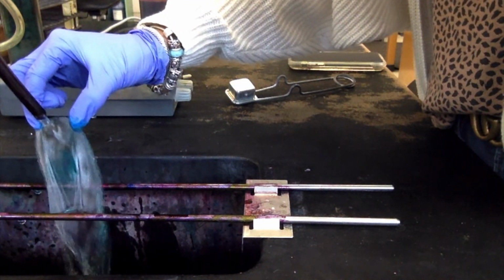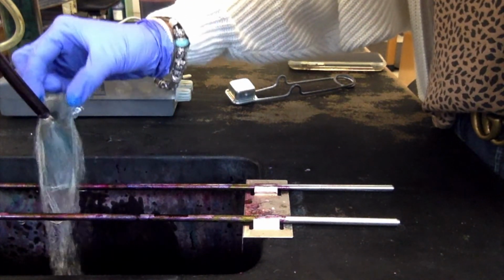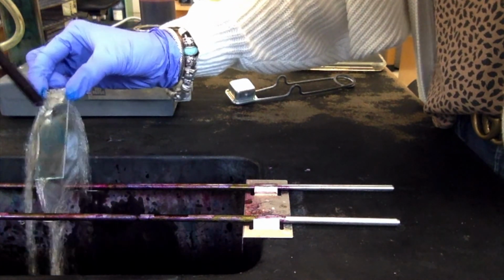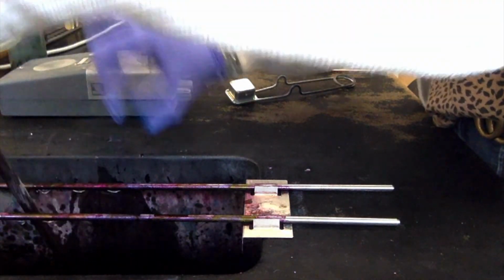And so it might take a little while. We want to try to get as much of that malachite green off as we can. And so remember, the malachite green is cooked into the spores. So we can rinse this as much as we want, and it's not going to come out of those spores. So we're going to rinse. All right, that should be good enough.